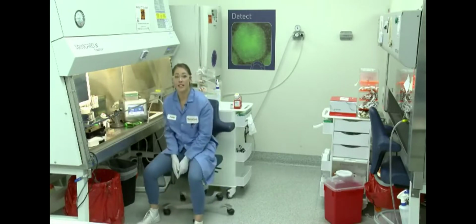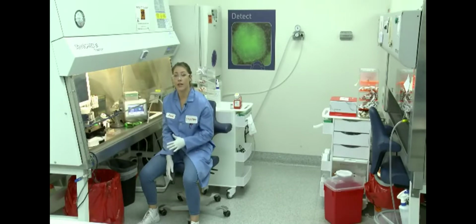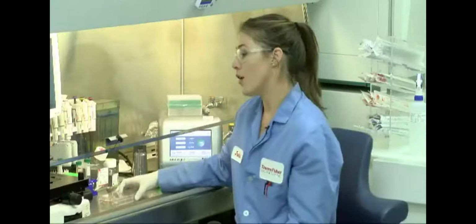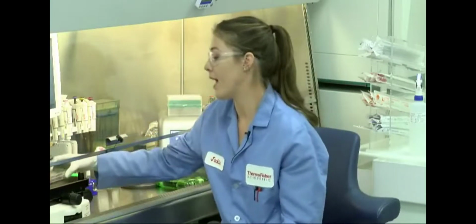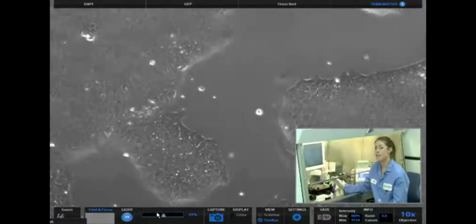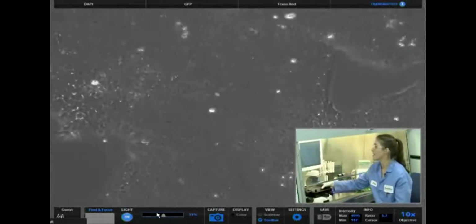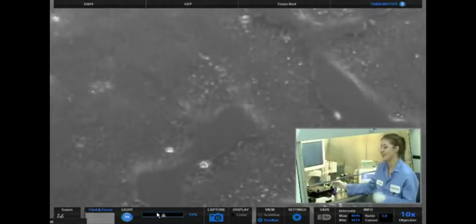Before you begin, you want to make sure that your cells are looking healthy and you want them at around 70 to 90% confluency in your culture dish. I have a 6-well plate containing my hiPSCs. I'll show you on the microscope about what they should look like. You can see that they're about 70% confluent, and the cells look good, so we're good to transfect.